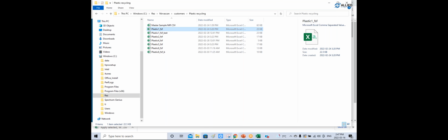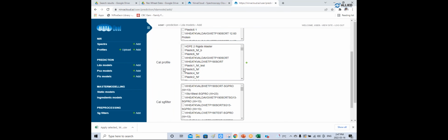So when you want to make your LDA model, you go here and say add LDA model. And then you would give it a name, for example, webinar March 16, a number of components 2, and then you would choose all those plastics, 5, 4, 2, 1, and so on.